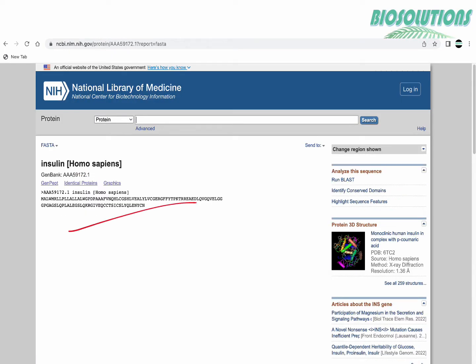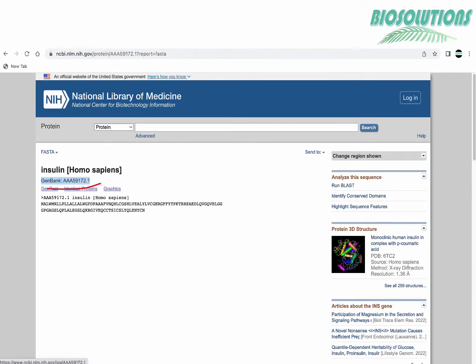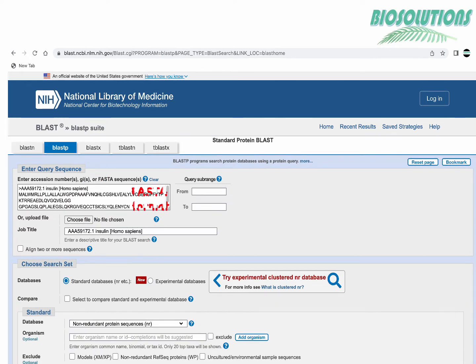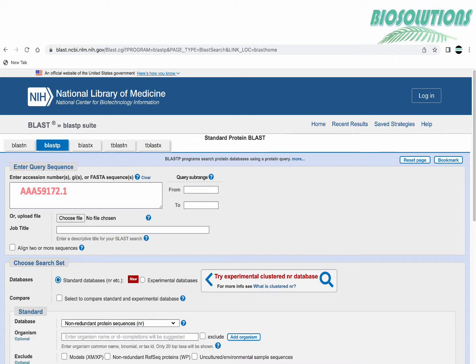Now in BLAST-P in the given text box we can either copy paste the sequence or we can write its accession number or you can even click on run BLAST feature on the links on right hand side. Additionally if you want to use only a segment of the query sequence enter the range in the two boxes provided here.